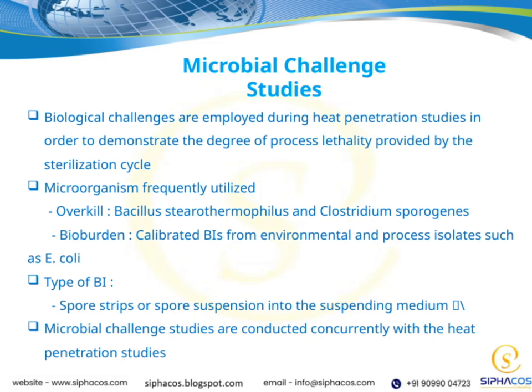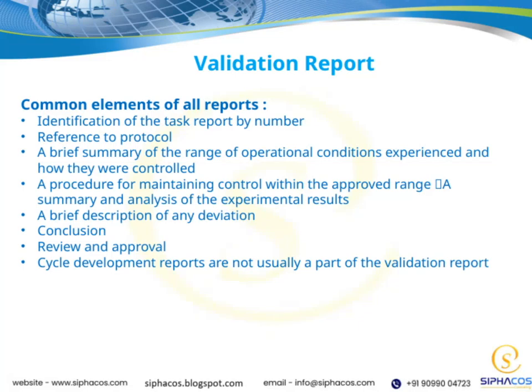Overall, these microbial challenge studies are a critical component in validating sterilization cycles, giving us confidence that the process is both effective and reliable in ensuring safety. Let's take a closer look at the common elements found in all reports.